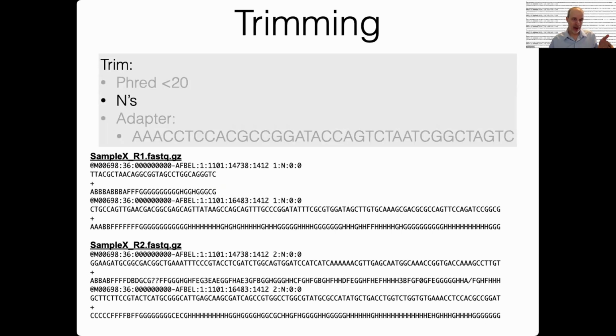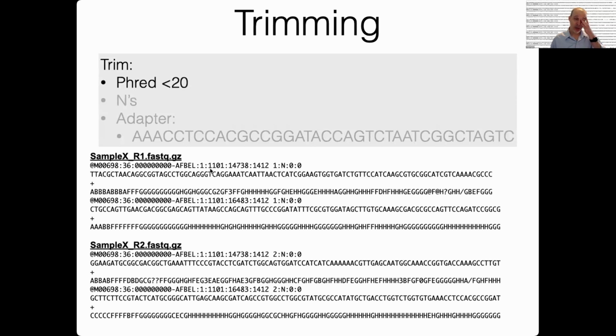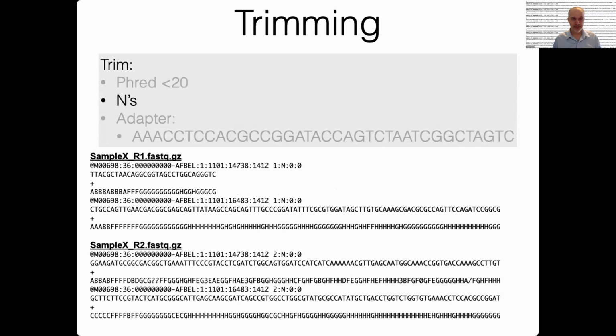This A was low quality. We don't trust it. So we're going to just get rid of it and everything 3' of it. Okay. So next we're going to look for Ns. I don't think I have any Ns here, but you can imagine, you see an N, you're going to delete the N and throw out everything 3' of it.